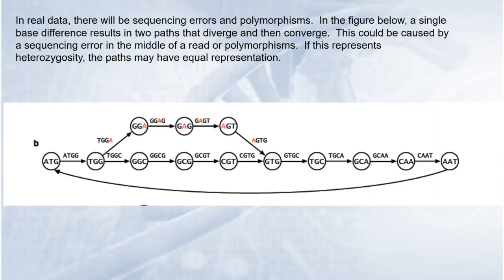Okay, and so that's fine, and of course it's wonderful that we have computers to help us do that. But there's a couple of issues that arise and reasons that things might not work, and that are very important to keep in mind when thinking about your data. So this is a slightly different version of this, but it's really the same process. We're finding a path that steps through these KMers in an overlapping way to go through this graph.